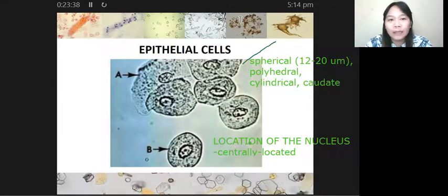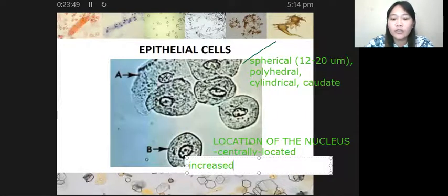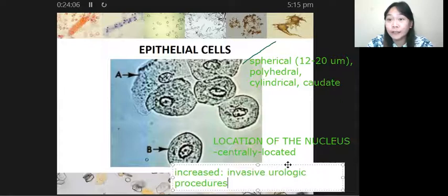Let me repeat that. They are usually increased in invasive urologic procedures in the laboratory, such as in the case of catheter insertion.